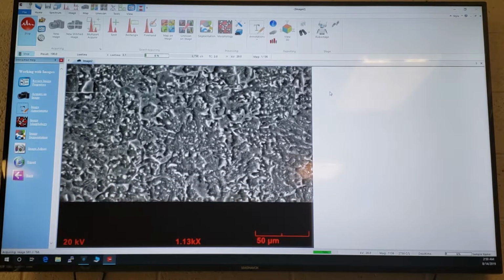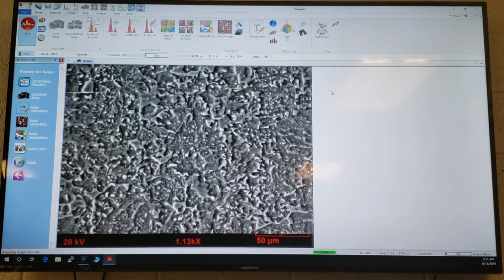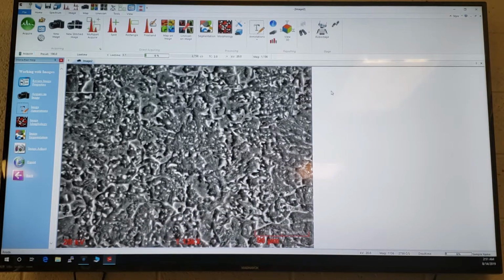Now the most important thing, for that image going crazy over there, because we take control of the scan coils and the video is just trying to figure out what the hell's going on. Okay. Yep. So now it's getting it back. So the most important thing for right now, but realistically, you guys don't really need to know this because this is going to be communicating by the time I get done with this, in my next visit. Not this next one, but the one that's going to follow that one.